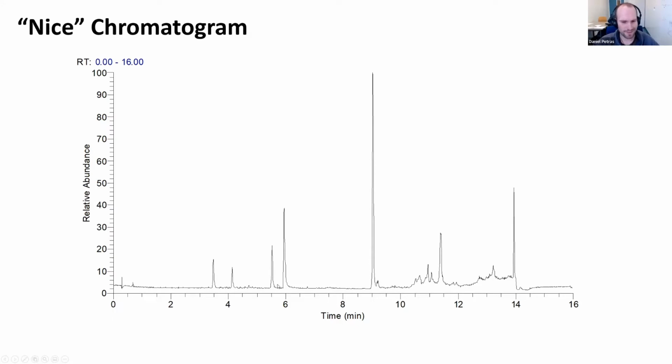They're kind of Gaussian, but you see many of them have this little tail, but that's all within an acceptable range. So if I would look at your paper and you have a chromatogram like this, then me as an analytical chemist, I would say, okay, that's a nice peak shape, and you probably did some good work there. And this becomes really important when you look at the masses behind these peaks, and especially the MS spectra, because obviously the more thin that peak is, the higher it pushes, right? And hence the better your signal response will be.